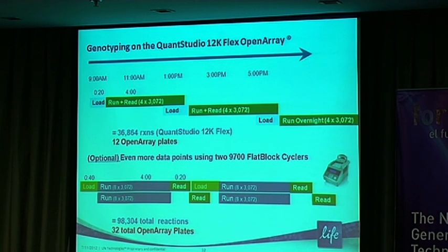Well, if that's the case, then we have these offline. This is just our standard 9700 thermal cycler. I've had these out for a number of years. Researchers can actually cycle these arrays offline, so off the machine itself. Because remember, for genotyping, we're not really capturing qPCR data in real time. Right? Traditional genotypers, you just amplify, and then you do endpoint detection.